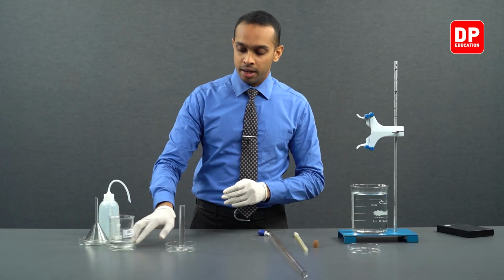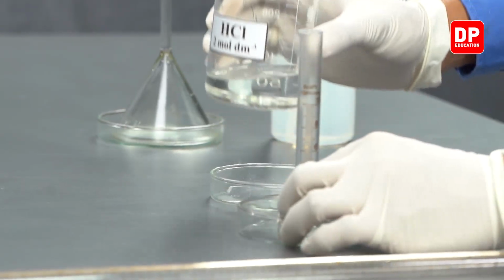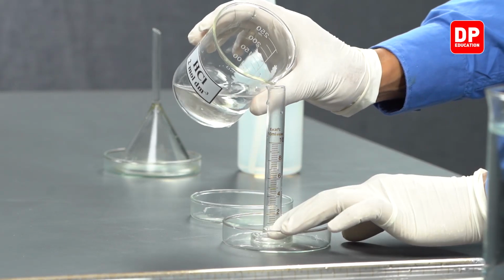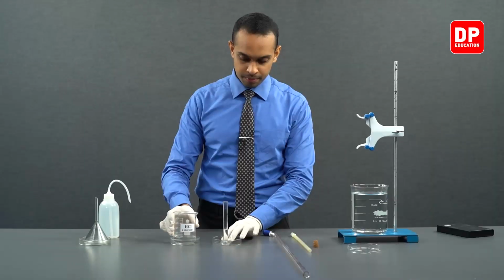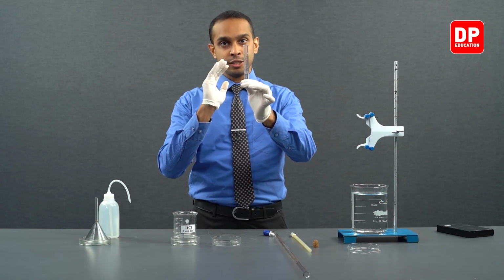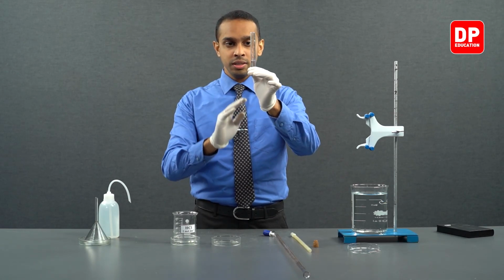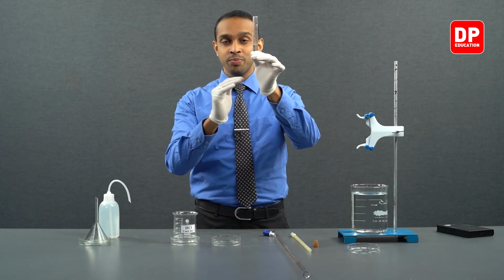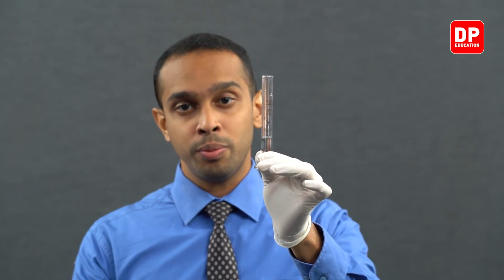We have our HCl solution here. We are going to pour it into our measuring cylinder. Now let's pour 5 milliliters of 2 moles per decimeter cube HCl. When you are measuring a solution or any liquid with a measuring cylinder, make sure that you bring the measuring cylinder to eye level so that you can see if the meniscus of the liquid or the solution aligns perfectly with the measurement you are trying to take.